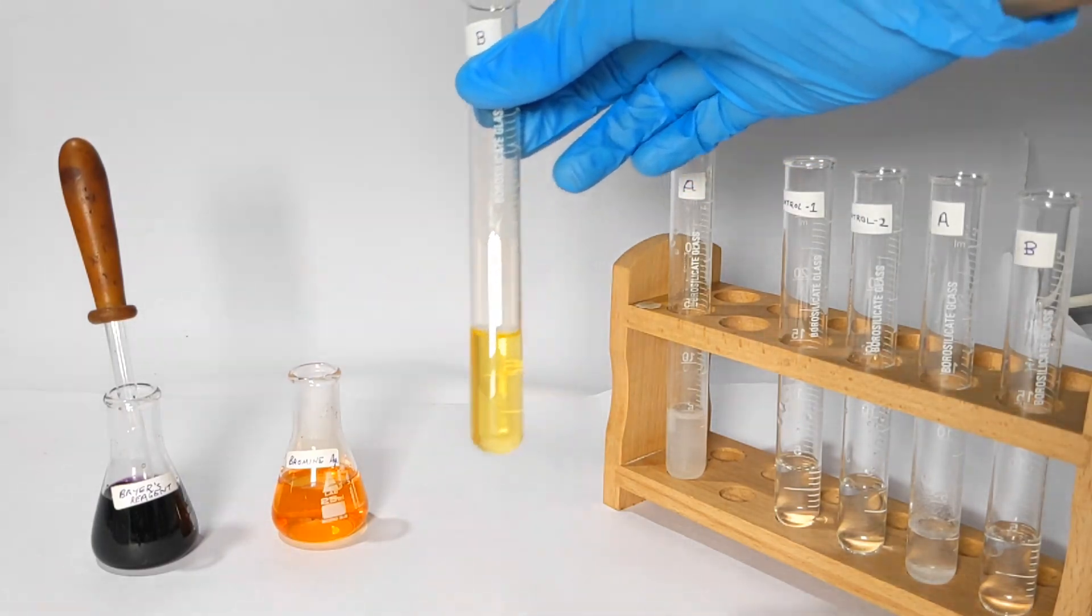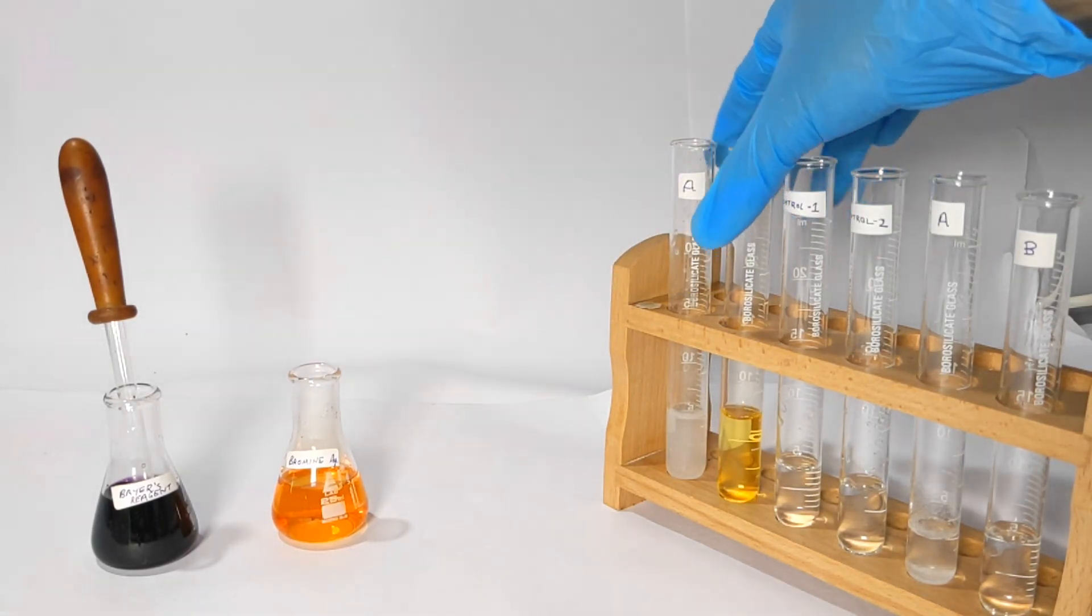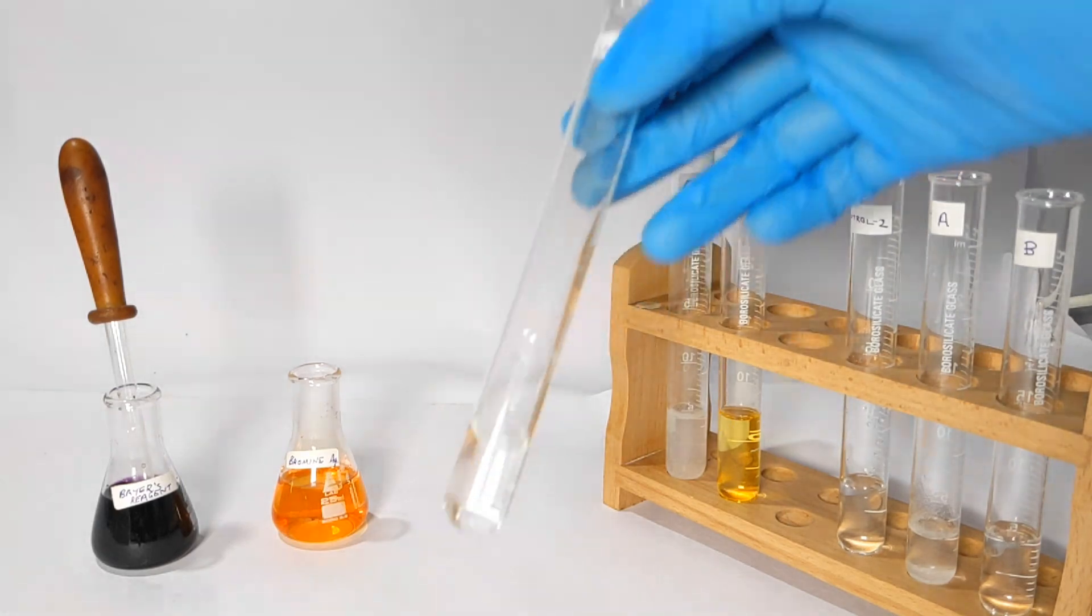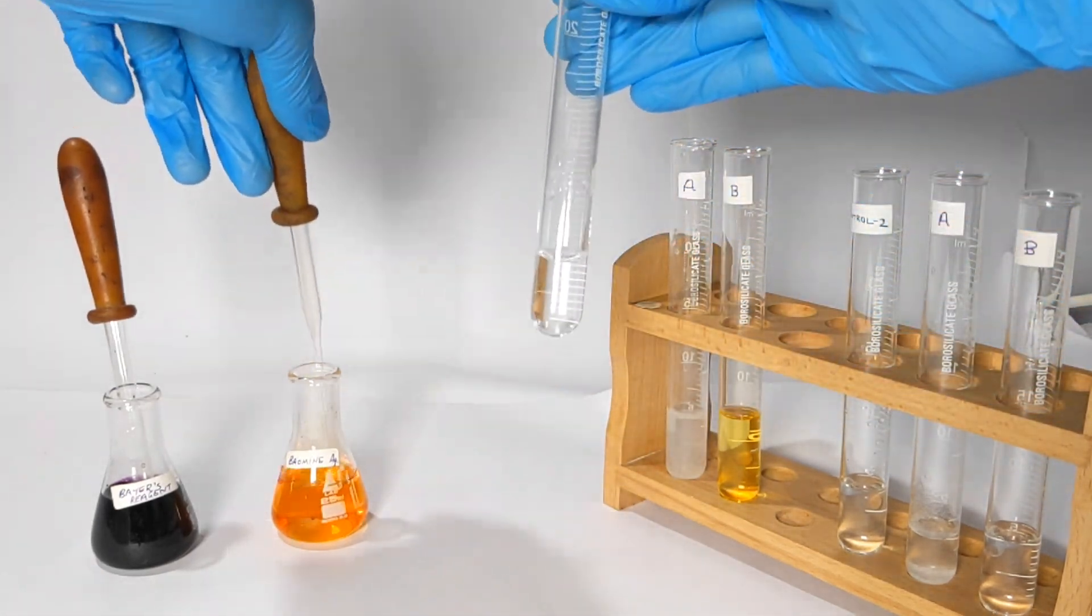Now for the completion sake, we will add the bromine water to the control which has pure water in it. You will see the color remains as in test tube B.